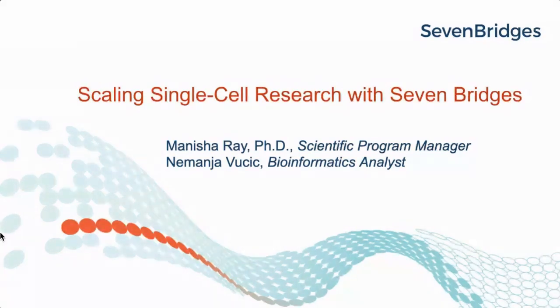Today we'll be giving a quick overview of the platforms themselves, and then we'll go into the tools that we now have available on those platforms for single-cell research. Then we'll end on some case studies that go into some detail. I'll be presenting the introduction, and my colleague Nemanja will be presenting the bulk of the talk on the actual tools themselves.